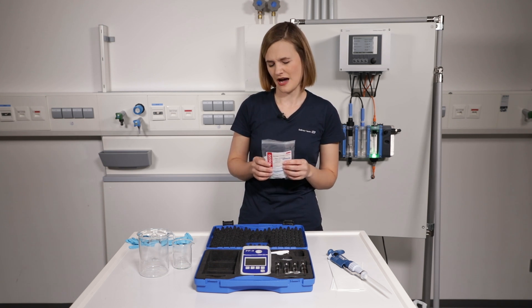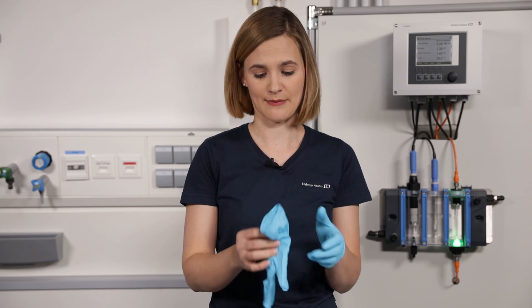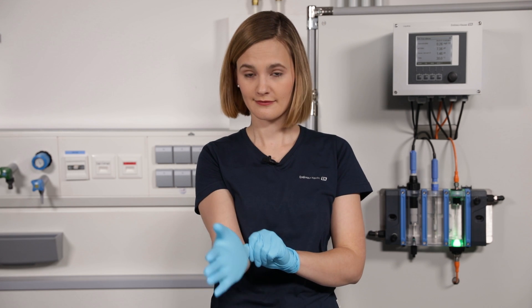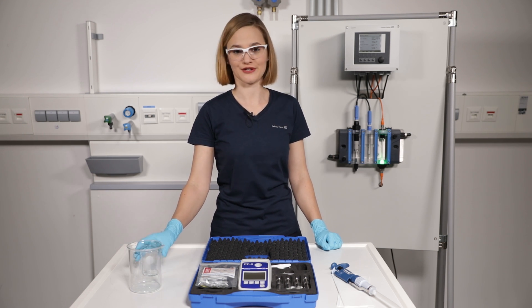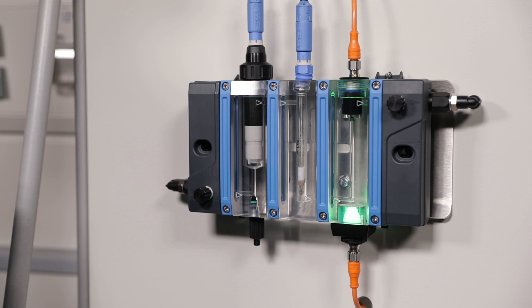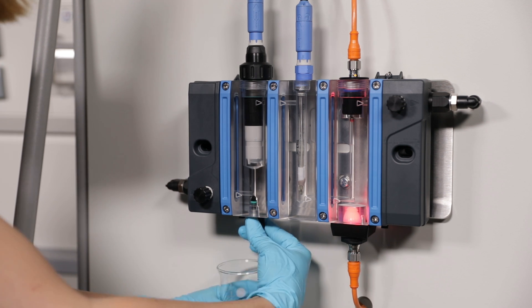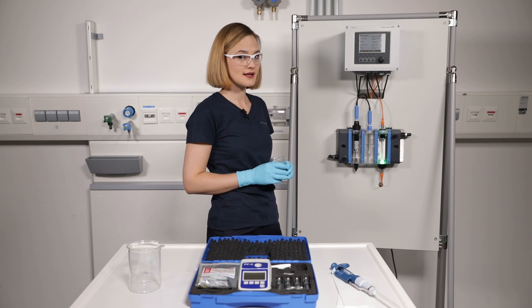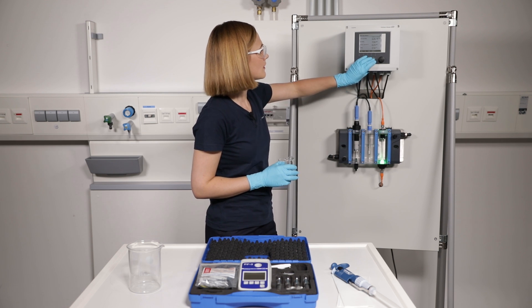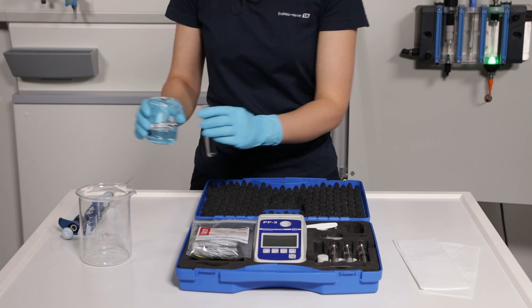Before you grab the sample, please take care of yourself and put on chemical resistant gloves and safety glasses. Now start with the zero measurement without reagent. The sampling valve of the assembly is perfect for taking the sample from the same place as the online measurement. For low flow conditions, activate the hold function so the transmitter will not generate an alarm.